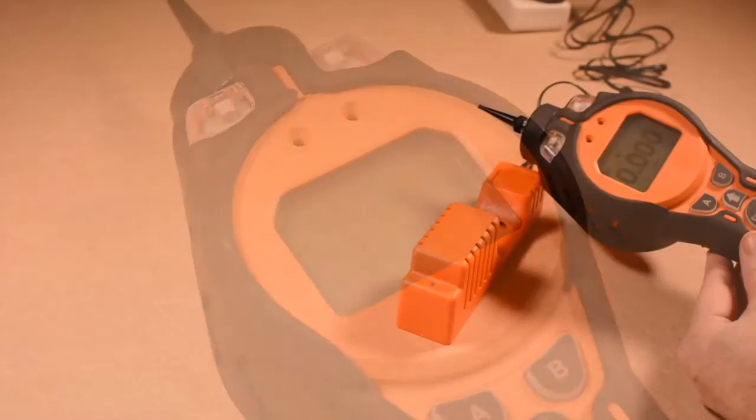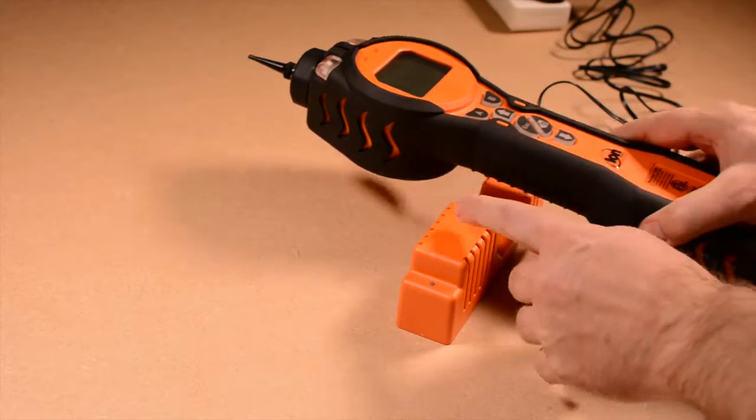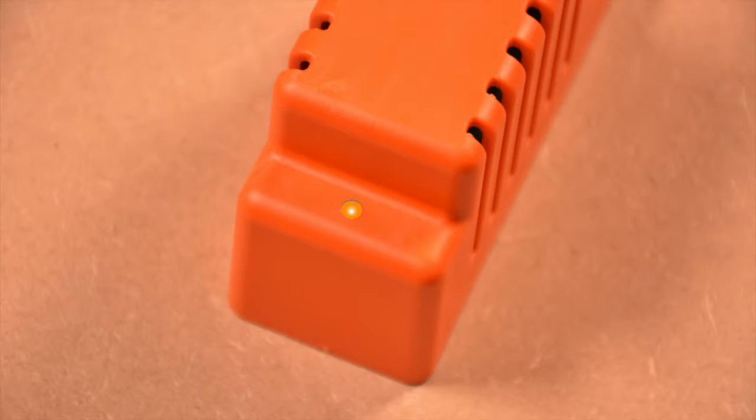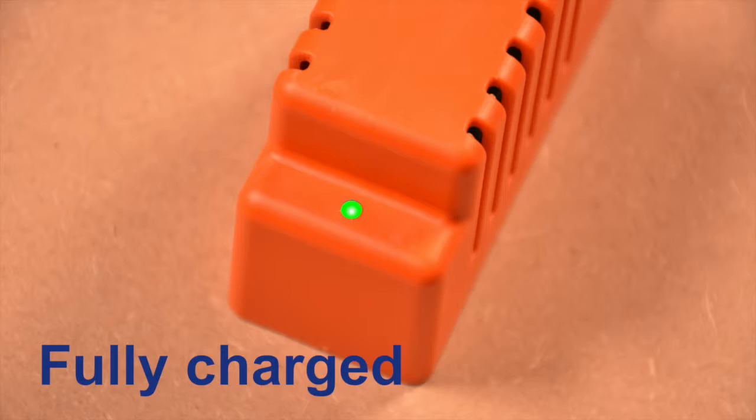To run the instrument while charging, switch it on before putting it on charge. When the instrument is fully charged, the LED will illuminate green. Your Tiger is fully charged and ready to use.